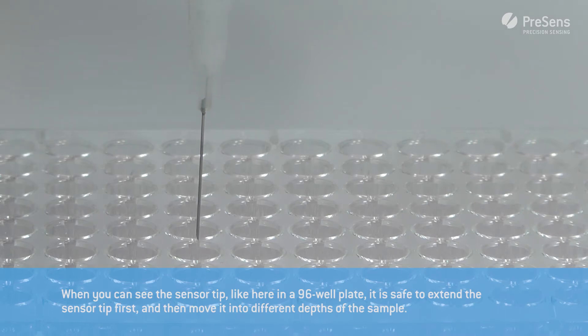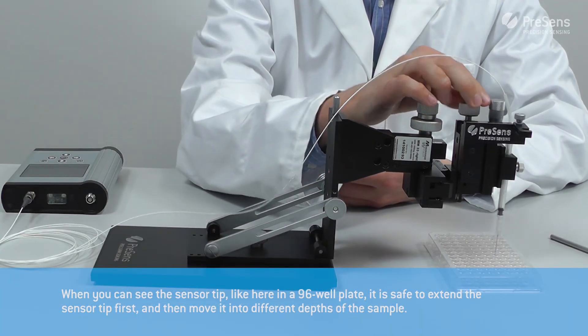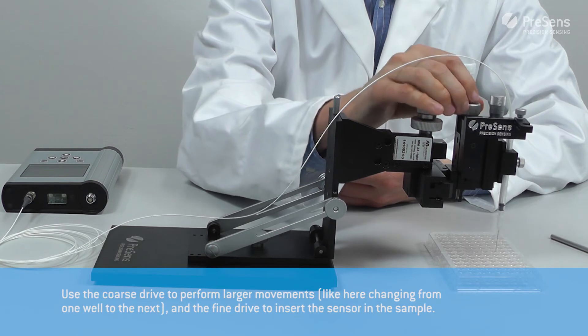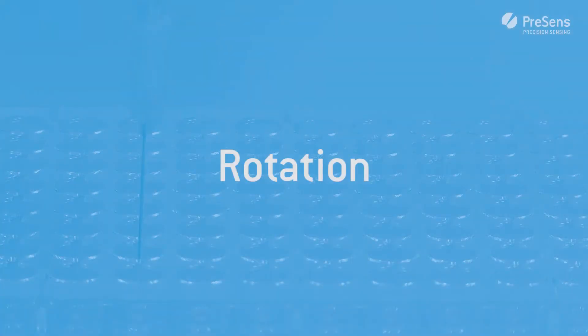When working with samples where the sensor tip is visible all the time, like here in the 96 well plate, it is safe to extend the sensor tip first and then move it into different depths of the sample. Use the coarse drive to perform larger movements, like changing from one well to the next, and the fine drive to insert the sensor into the sample.